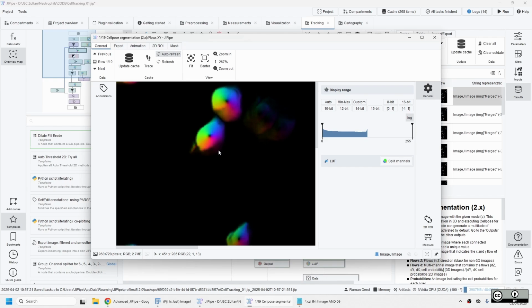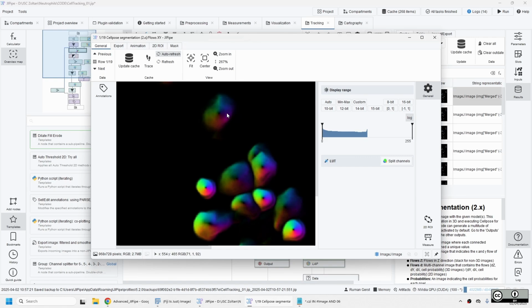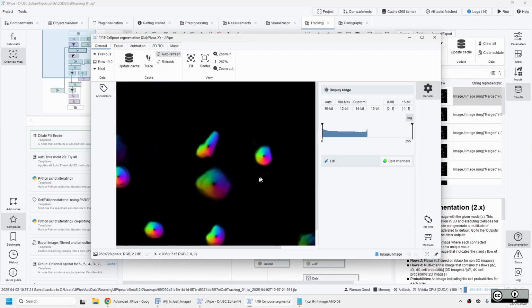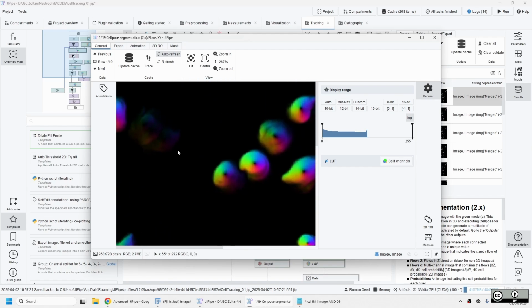I didn't look at the ROIs when I tested it with the 15 models. I looked at the flows. Does this pre-trained model know what this is? Has it seen it? And Cytoplasm 2 was the one where I got these rainbows most complete. And as you see, it's really doing a good job. Even the ones which were dimmer on the probability map, it still has the proper rainbow range. What this means, you can again Google it or ChatGPT it about Cellpose, but this works very well.